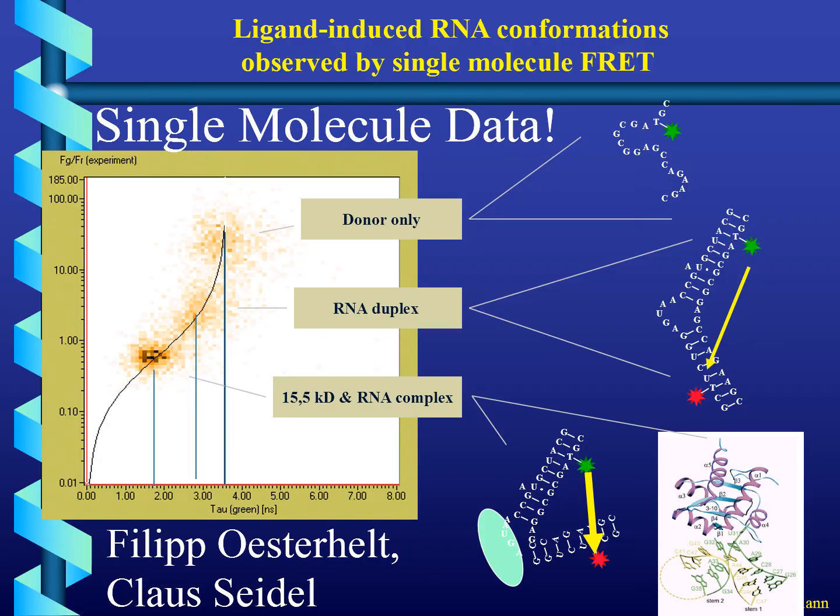Here's a side remark. So what you see here is single molecule FRET measurements. So you're doing single molecule measurements of the lifetimes, and you see this interesting effect, how the relative ratio of intensities changes with the lifetime change that you see at the same time. And you see as the lifetime goes longer, you also have a brighter emission, and if the lifetime goes shorter, you have a shorter emission.